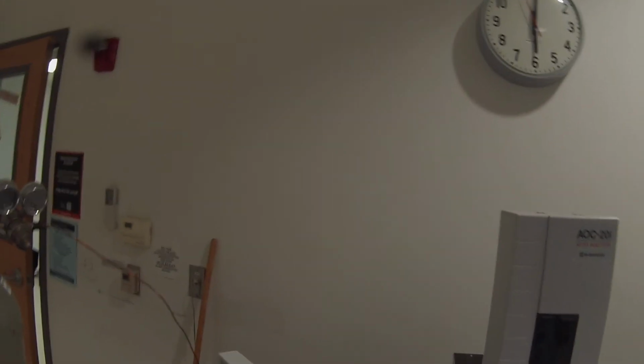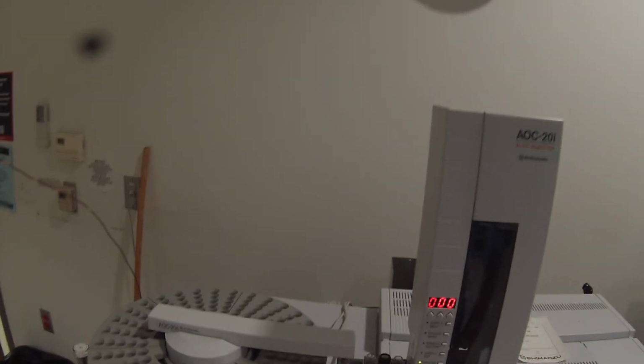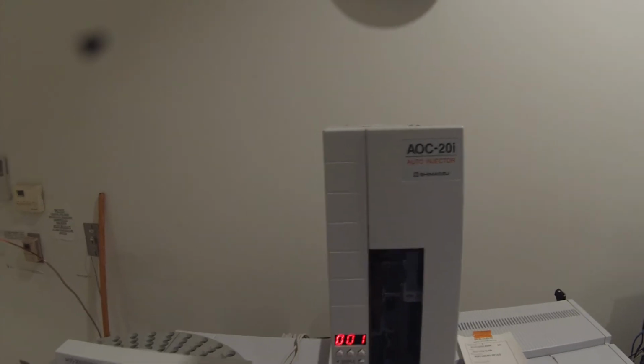So once it's done setting the parameters, it's going to go and grab that first sample. Adjust my camera again and put it in the sample rack. And then the syringe here is going to go and wash the syringe with methanol.